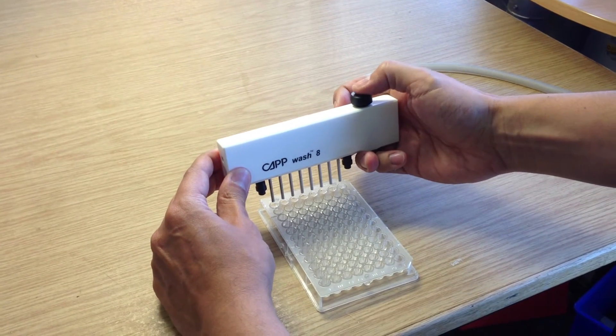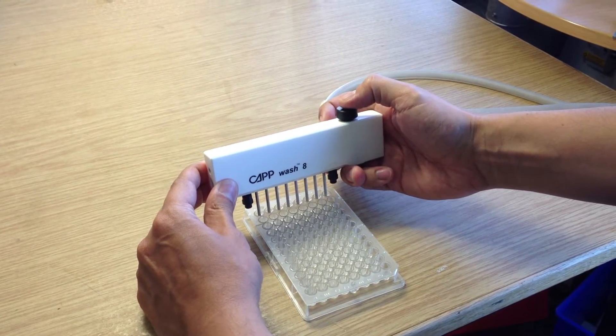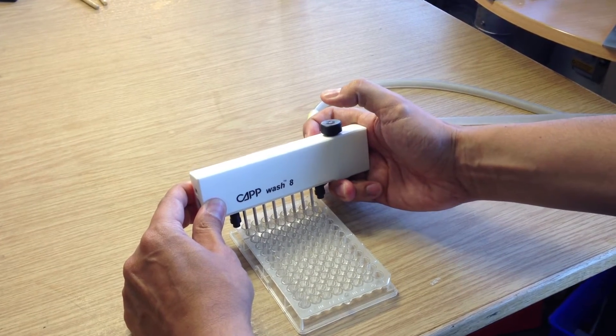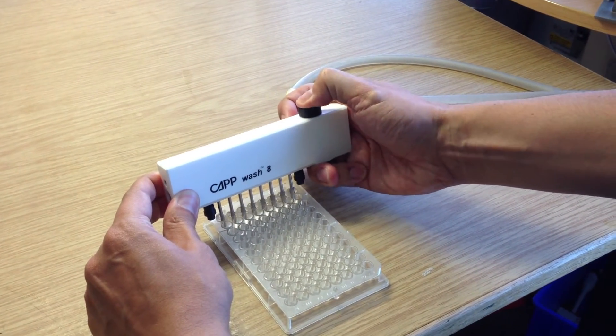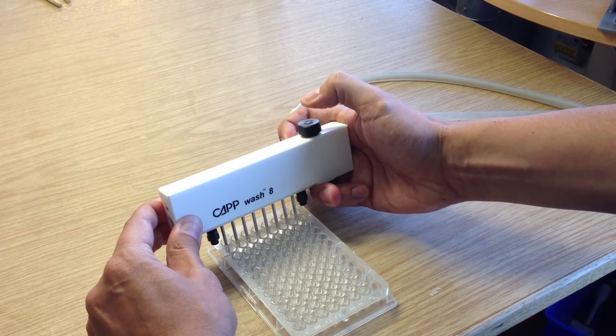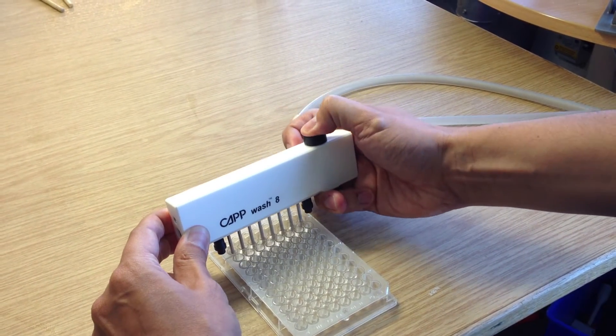And by pressing this knob here I automatically release the water. And when I release the knob it will aspirate again, so you have to keep pressing. And then you create the washing effect. Once you're done you can move to the next row.